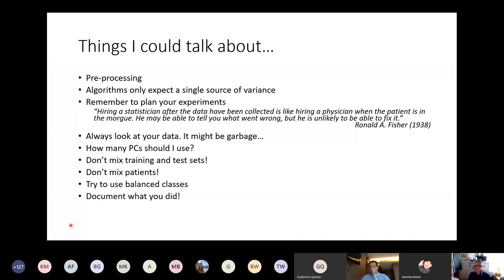And this was picked up in a sense yesterday by Claudia, I think it was Claudia, who said that we really need to have the chemometrician, someone who's going to do the data analysis, involved at the beginning of the work and to carry through, because they are as important in getting you to a good and robust answer at the end as the instrument operator is. And ideally, we would like the instrument operators to be knowledgeable in chemometrics too. But getting involved at the beginning is quite important.